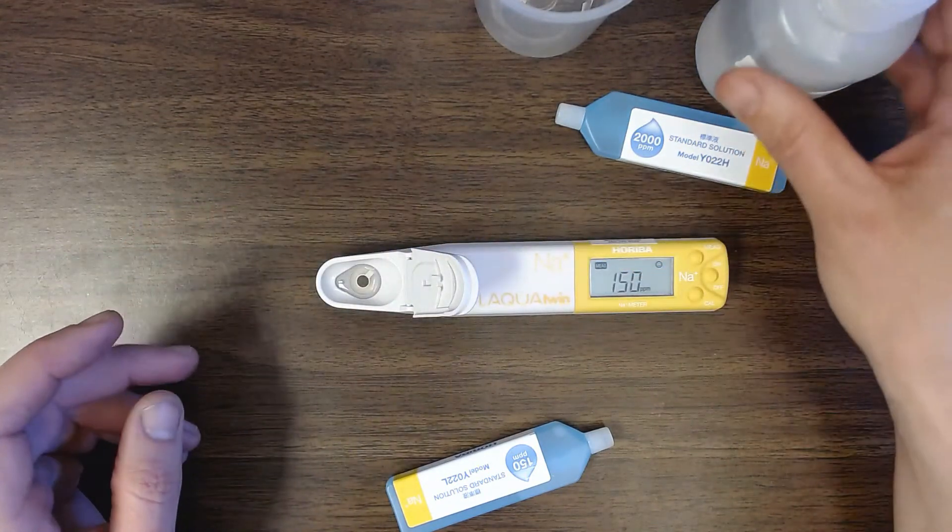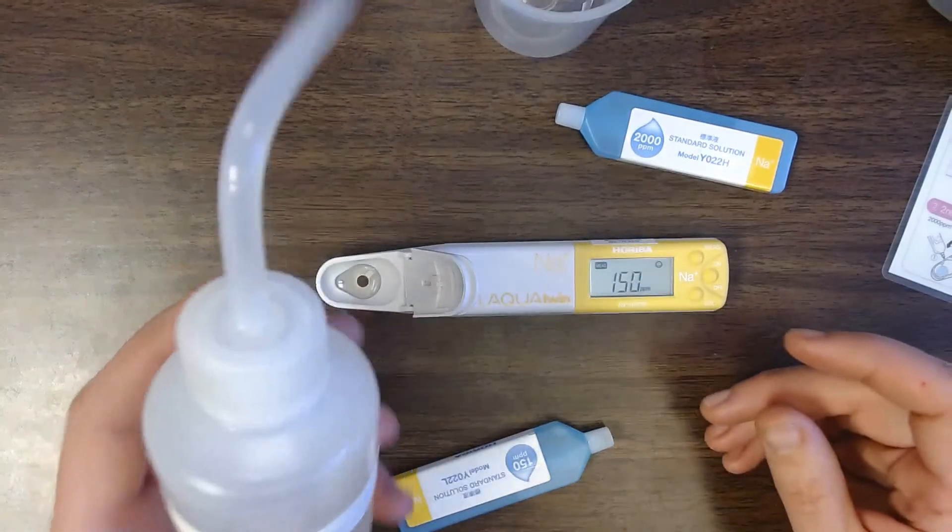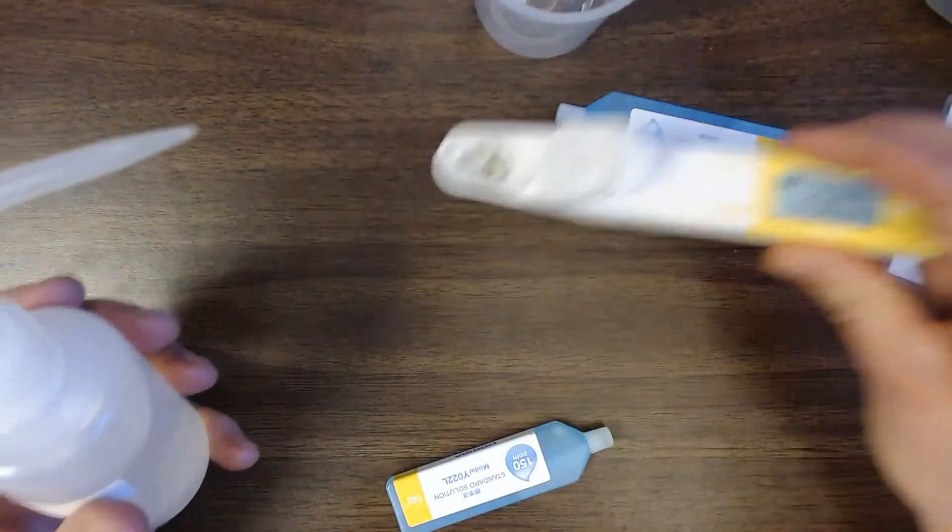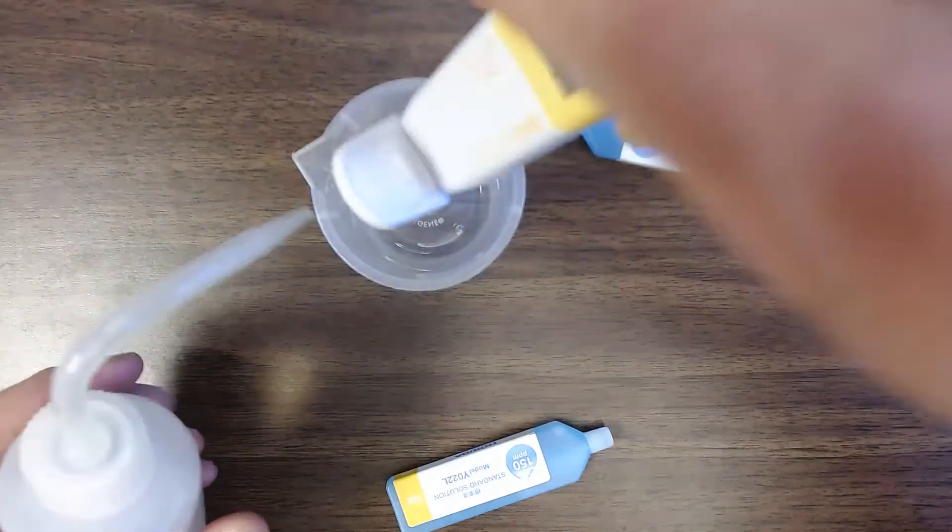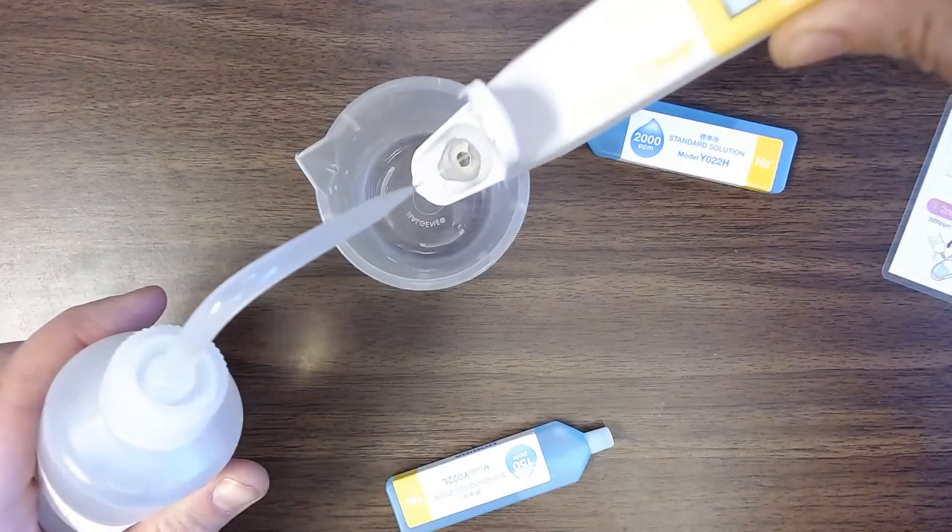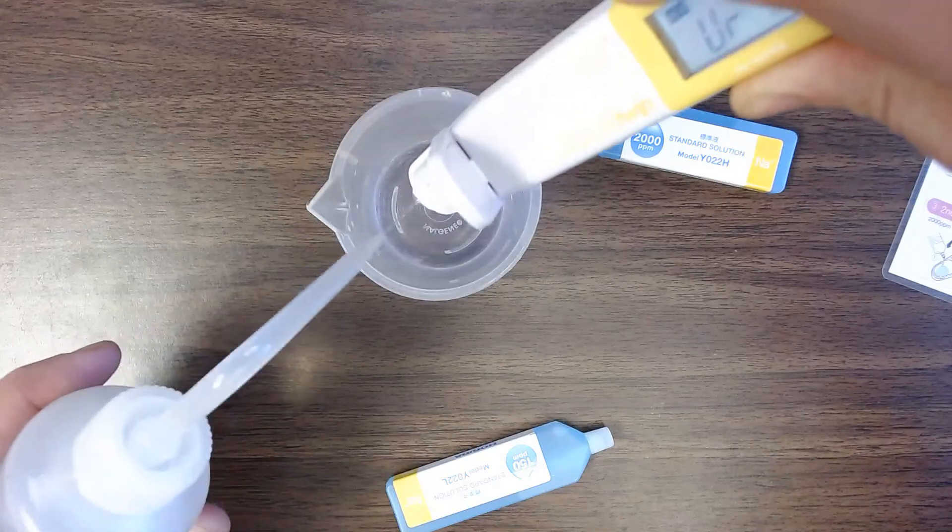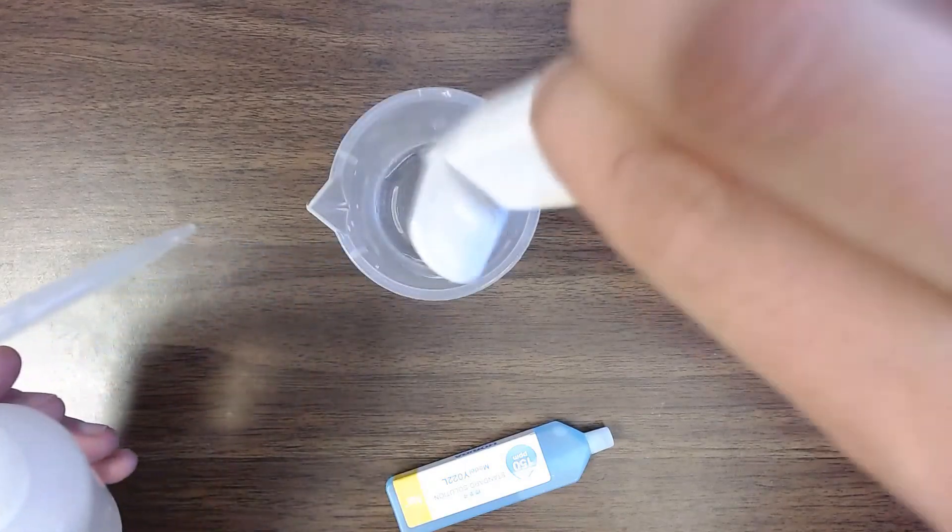Then I need to clean this solution out. So to do that I'm going to take some deionized water here. And I'm going to use a little beaker. I'm going to just dump out that initial solution. And I'm going to rinse off the electrode with the DI water. Okay get rid of that.